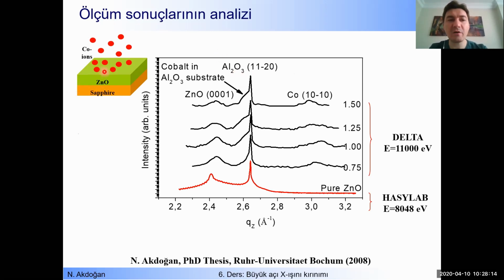So what about zinc oxide? Here we have an additional peak. So this comes from the zinc oxide. Here you see oscillations. These are called Laue oscillations, which show the quality of the crystal structure of the zinc oxide. Okay, it is grown with very nice crystalline quality. These Laue oscillations show that.